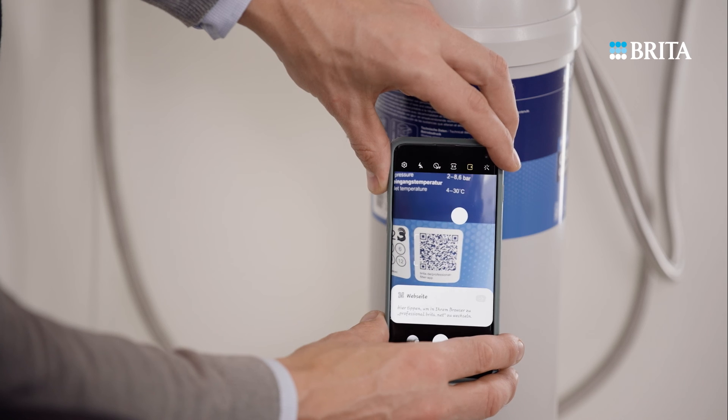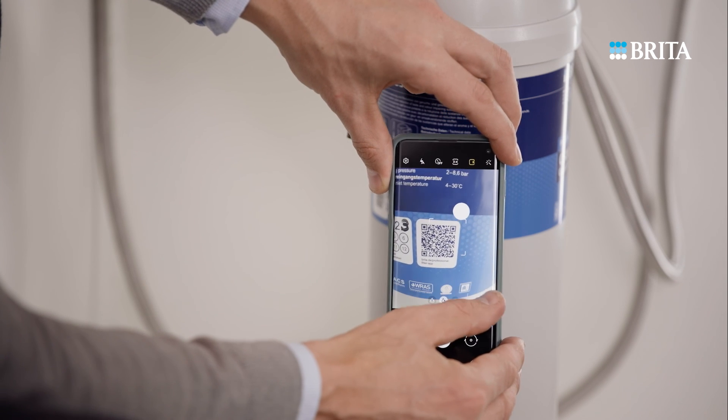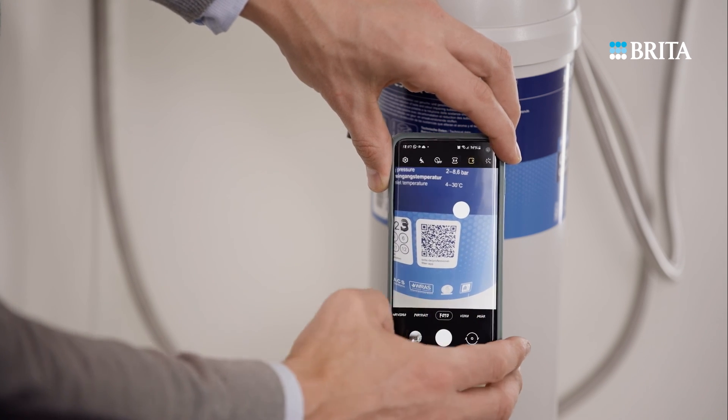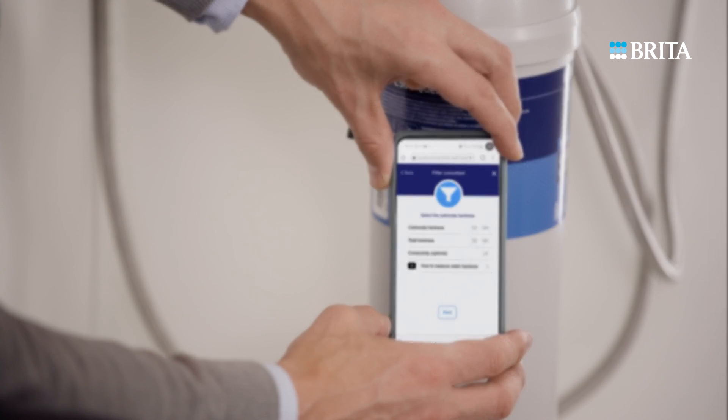Consult the product manual or use the Brita Professional Filter Service app to see which filter type and bypass setting are recommended for the water hardness you have measured. Then set the bypass on your Brita product accordingly.